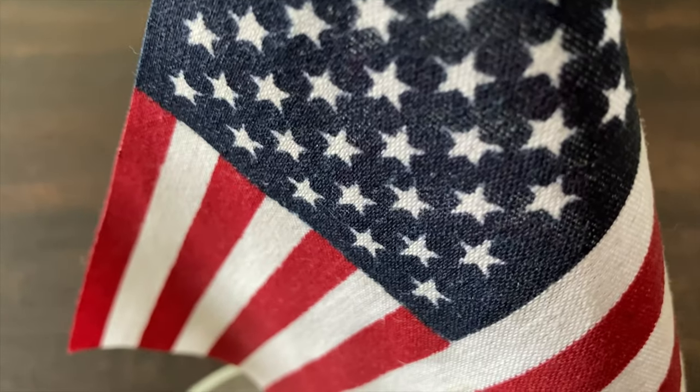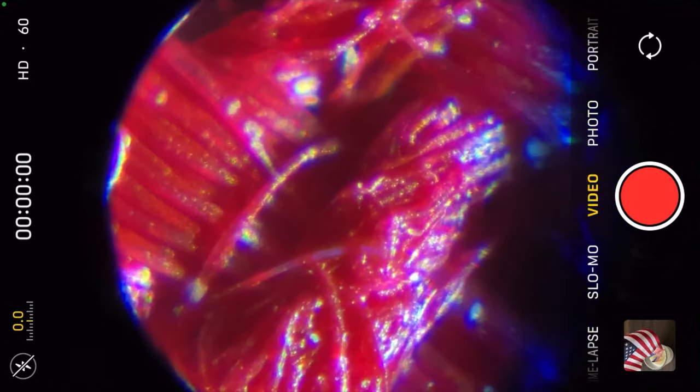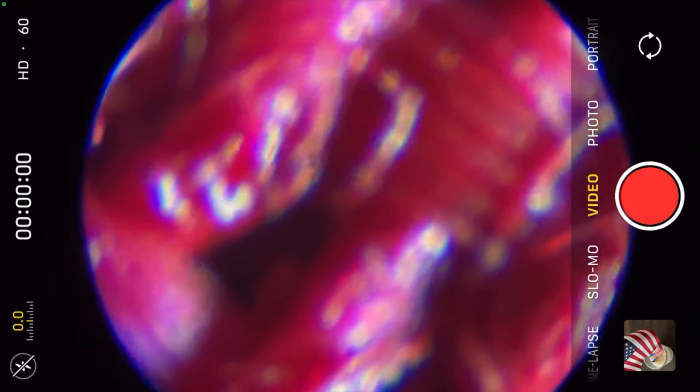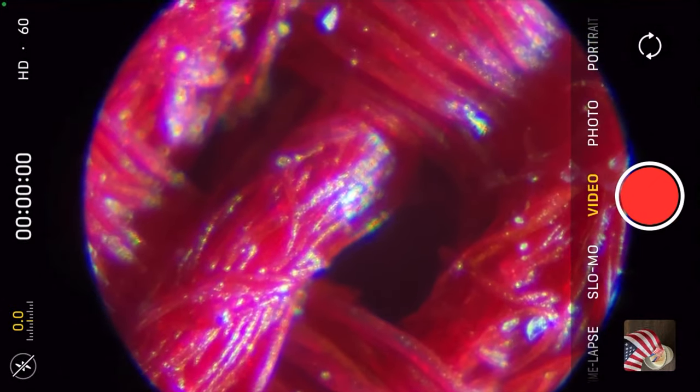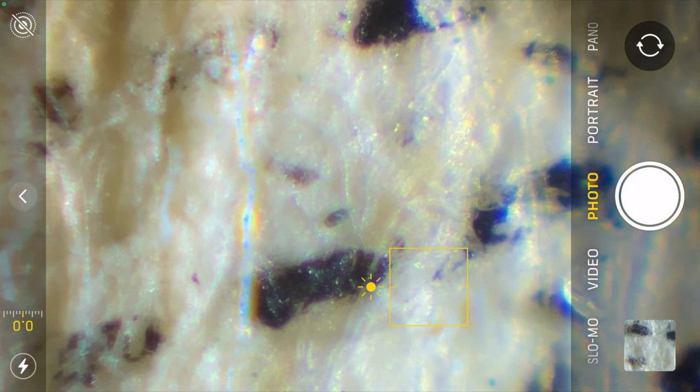I also tried getting a close look at an American flag. What I saw was pretty impressive — I could see all the little threads woven together, although I'm still not sure what the material was. It looks so shiny it makes me wonder if it's plastic. Then I looked at another American icon: a dollar bill. If you are homeschooling, or just want to get more involved with your kids' education, this is a great experiment. The dollar bill is loaded with wonders that can be revealed with a microscope.